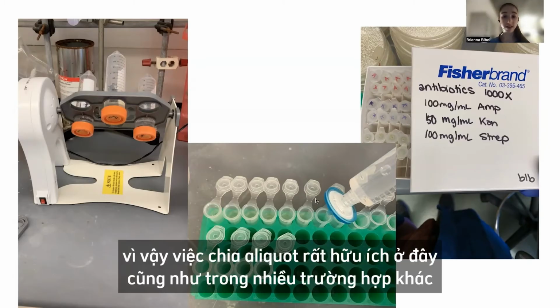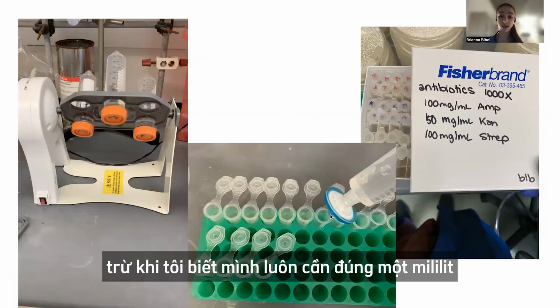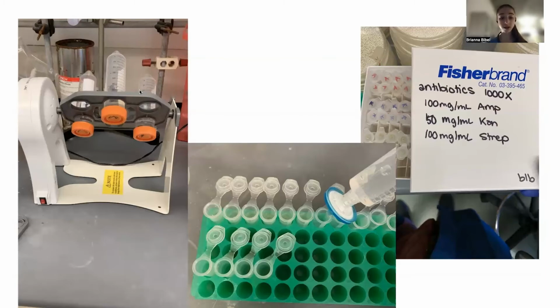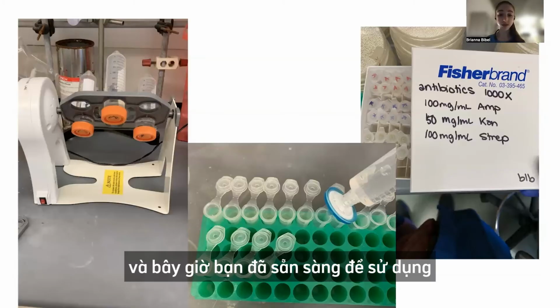So aliquoting comes in handy here as well as in other places. Typically I don't worry too much about the exact volumes of these aliquots, unless I know I'm always going to need like a mL, and then I would make them all exactly a milliliter. Otherwise, I just syringe it in there. You might need to let them mix a little while in order to completely dissolve.